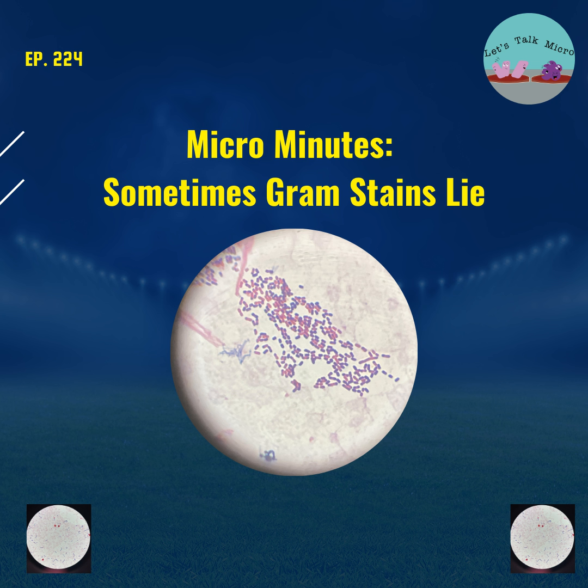What I will say is that it's such an important and valuable tool. As you know, it has four reagents, and it provides such valuable information. But the technique takes a while and a lot of repetition to get right, and even then you still make mistakes. So it's very important to get familiarized and do that repetition. That way, when something goes wrong, you still have that feeling and can spot it. At least you stop and take a second look, maybe ask someone, and then move on from there.